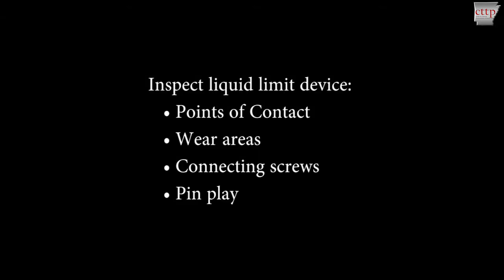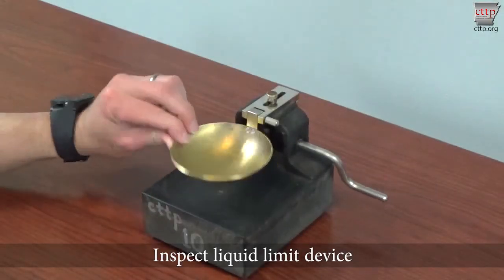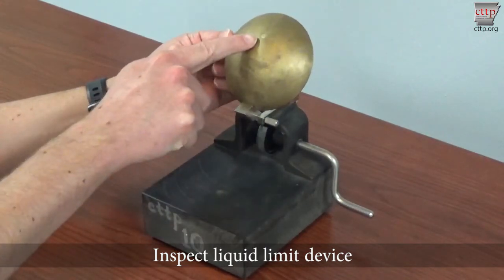Inspect the liquid limit device prior to use. Check points of contact, wear areas, connecting screws, and pin play. Points of contact include the bottom of the cup and the base of the machine at the point where the cup contacts the base. Points of contact should not be greater than 13 millimeters, or approximately half an inch, in diameter.